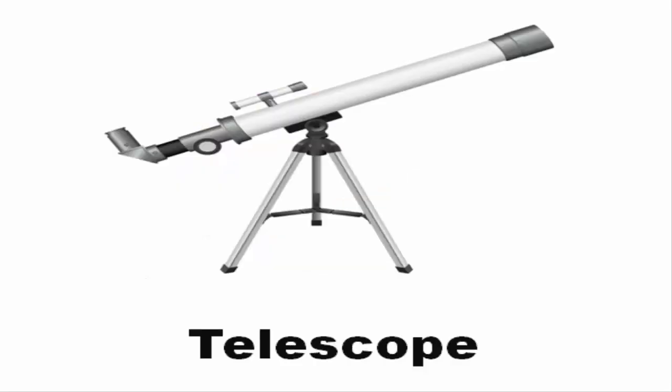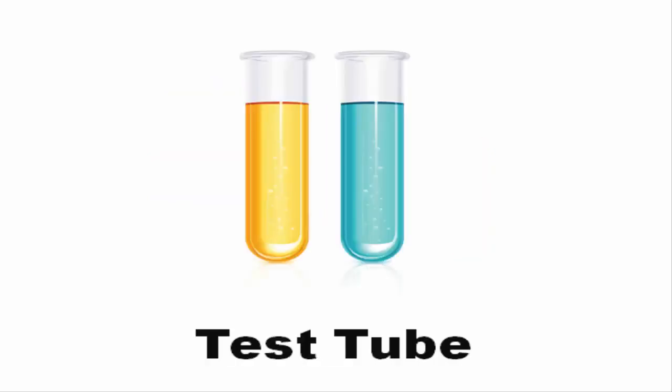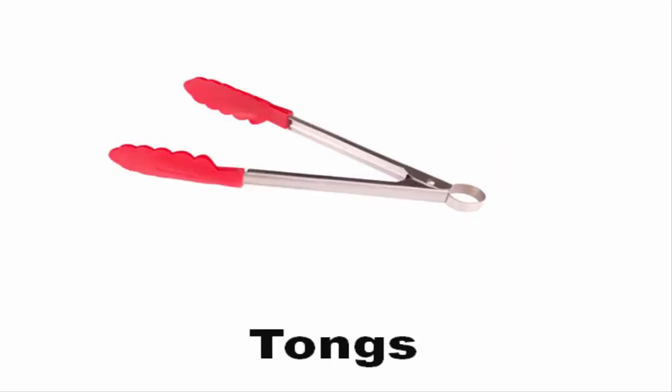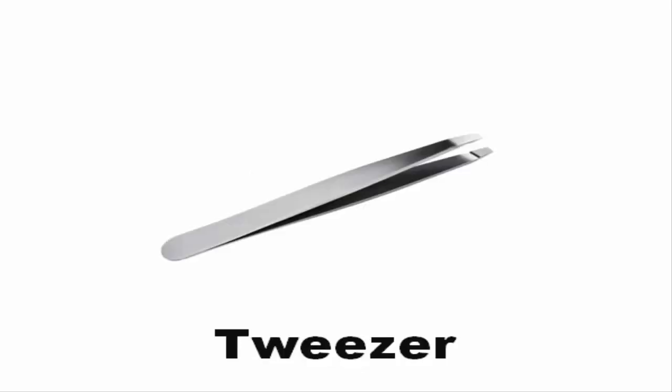Test tube. Test tube rack. Thermometer. Tongs. Tuning fork. Tweezer.